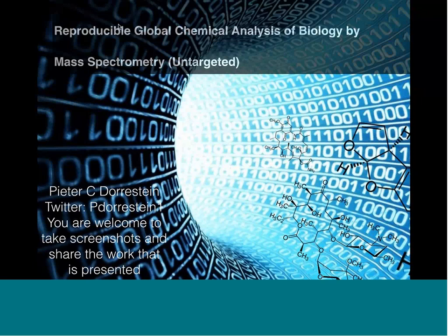So one of the first things that we're doing is we're building or taking some of these in silico methods, such as CSI:FingerID and MetFrag, and we're providing those annotations to the community as well. And again, there we're going to rely on the community to tell us whether they believe those annotations are correct or not, and we'll capture that knowledge. And so this is one of the strategies forward of how we're going to improve a lot of these annotations. There will always be molecules that we cannot annotate, and for those we have to isolate them and do NMR structure elucidation.